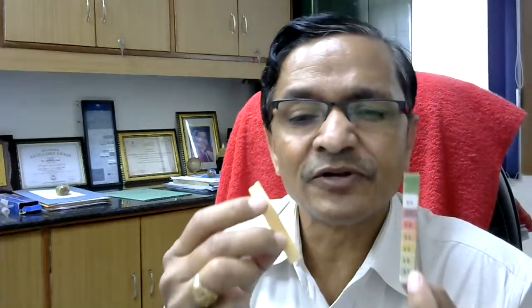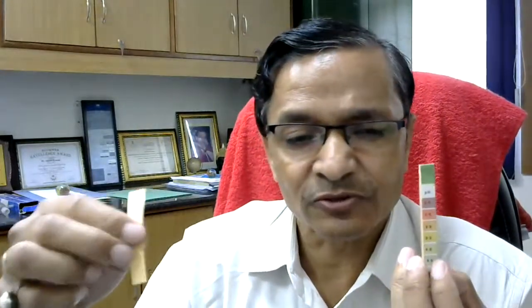This is roughly going to give you an idea of the pH, and you can see whether the particular solution is acidic or basic. Of course, this is not the whole range of pH, only a minor range. Different ranges of pH paper also come, and then you can find out the pH of that particular solution.